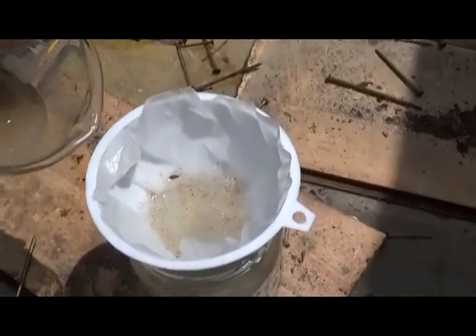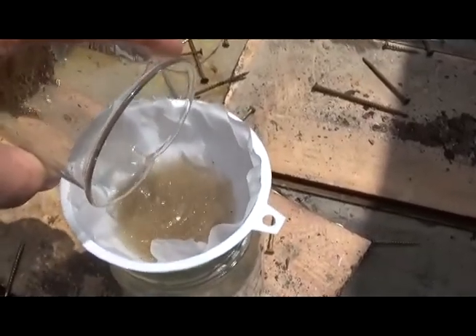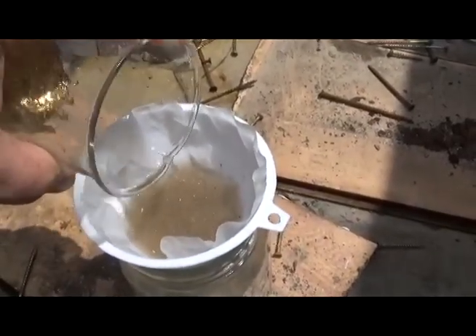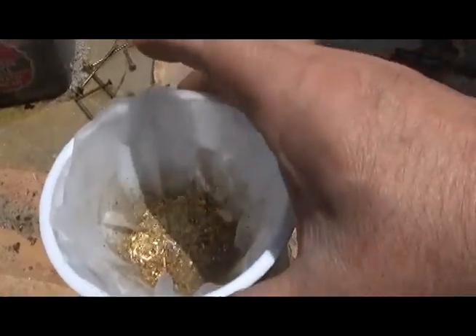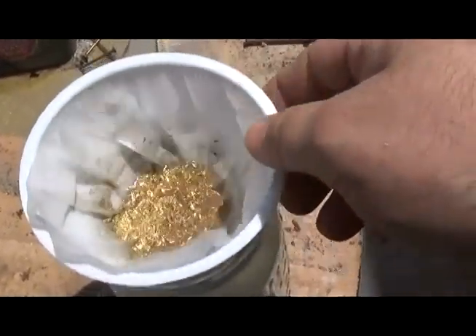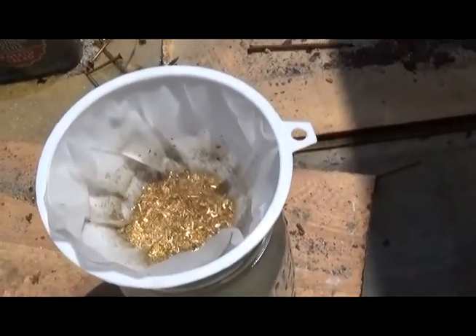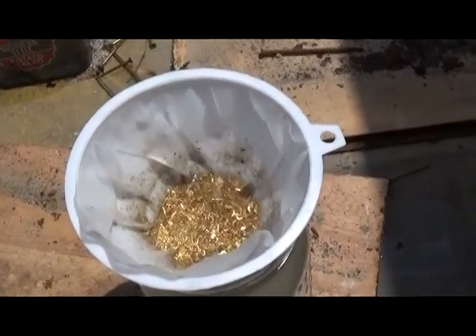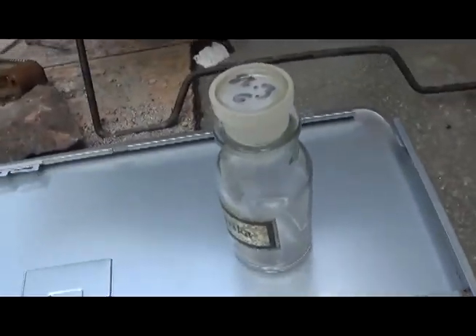We'll filter this out and see what we've got. That is an impressive wad of gold — heavy too, but it's dirty and nasty. There's a little bit of fiber from the boards and stuff, and some junk that will burn up in the furnace. We're going to take some of the gold here — about one gram — and put it into aqua regia.